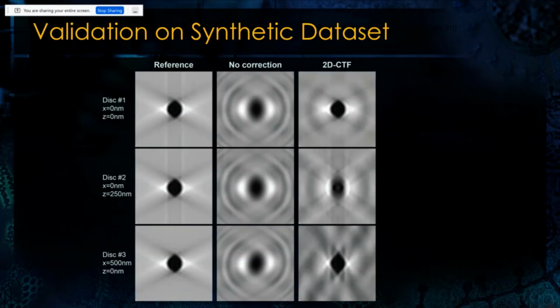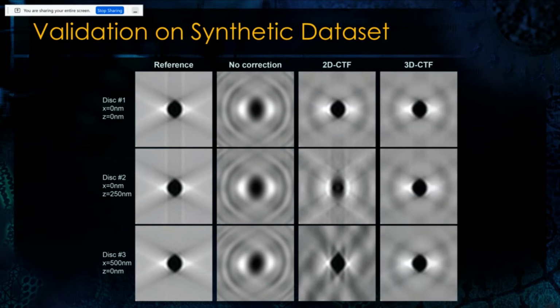And if we now compare how it actually looks in comparison to the other methods, we see that with the 3D CTF, regardless of the position of our beads, we can reconstruct them with the proper shape and with minimal distortions from the CTF.